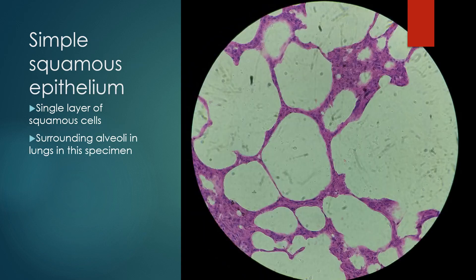Number four was simple squamous epithelium. What you'll see here is a single layer of squamous cells. I was showing you that it was just a very thin layer surrounding these alveoli in the lungs. This is just empty space right here—all of this white is just empty space. There's actually no tissue there at all because those are the microscopic air sacs within the lungs. Surrounding those is your simple squamous epithelium.